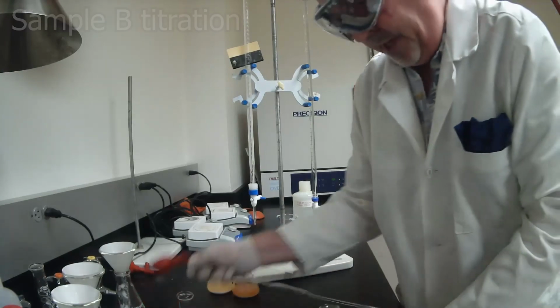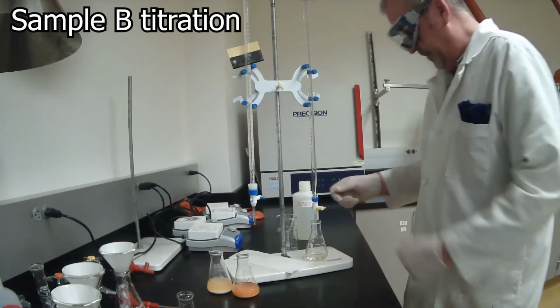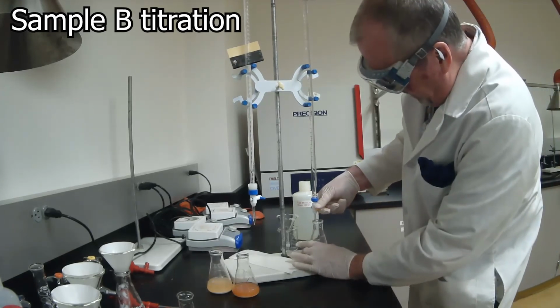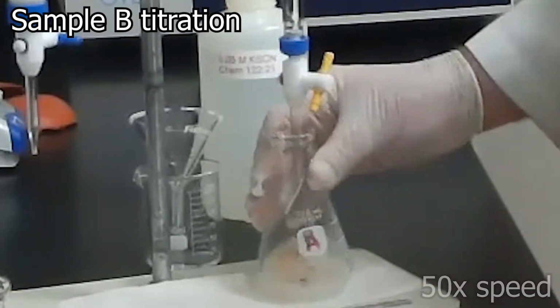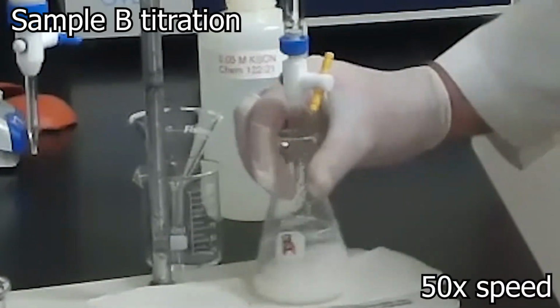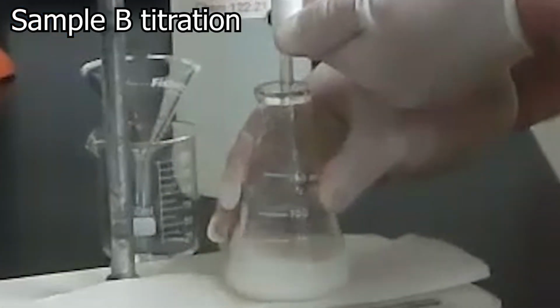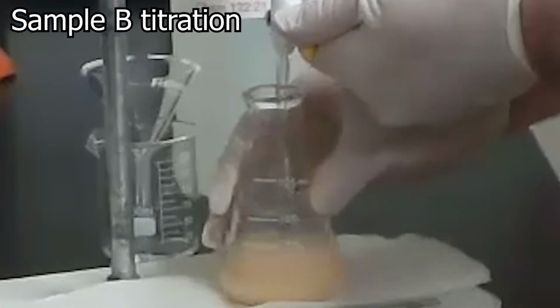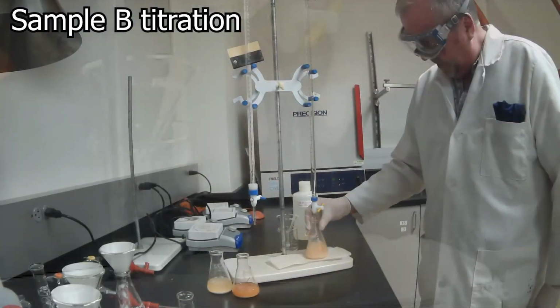Now for sample B, initial volume is 0.00 milliliters. And now we're going to titrate sample B. All right, we reach the end point.